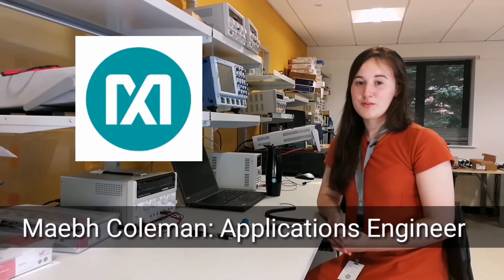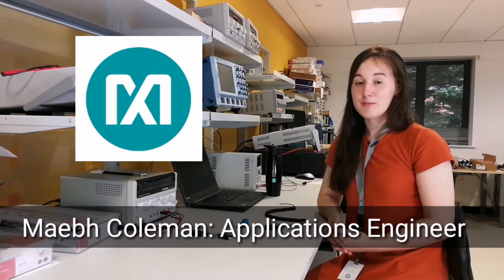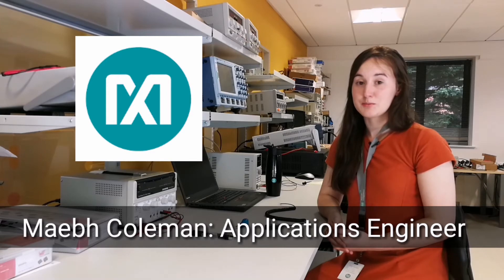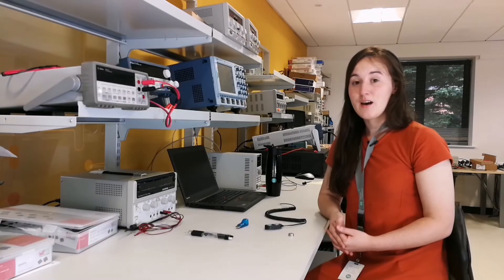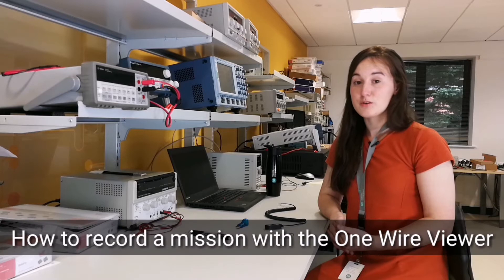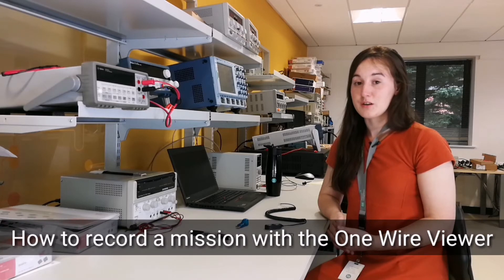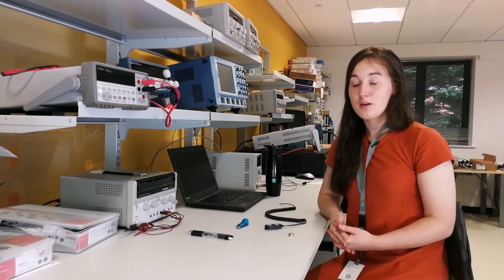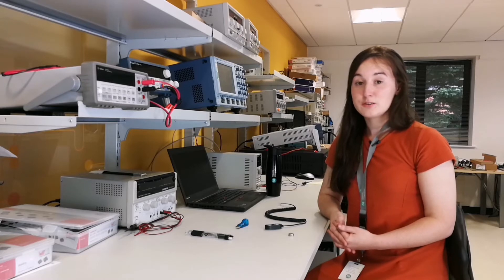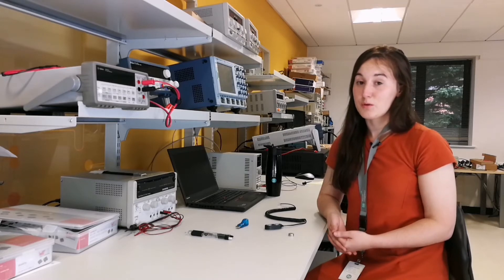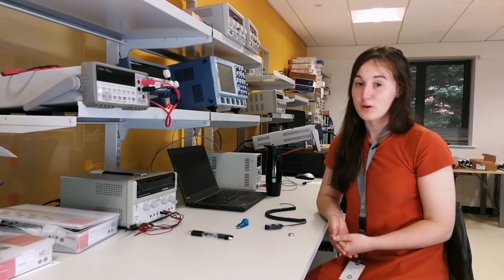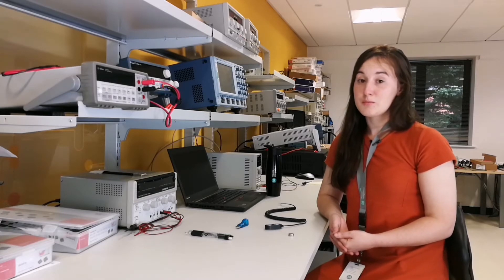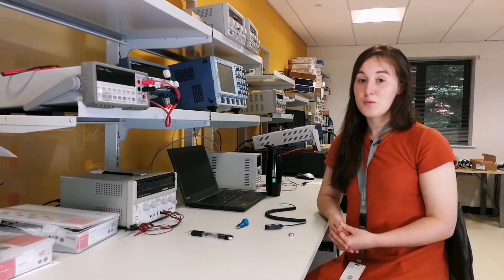Hello my name is Maeve Coleman and I'm an Applications Engineer here at Maxim Integrated. Today, I'm going to talk about how to record a mission with the OneWire Viewer. This video can follow on from a previous video, how to set up the DS1922L with the OneWire Viewer software. It can also be accompanied by the user guide, OneWire Viewer User Guide.